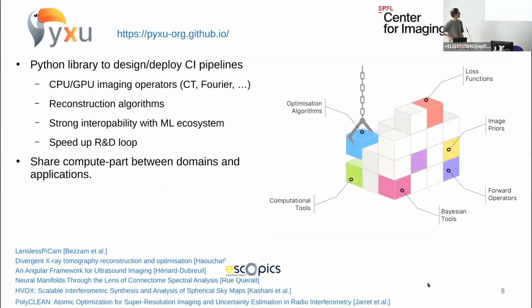So right now we are developing V3, which should be released in the next month or two. And I would say the main change compared to what you will see on the website is that we are having even deeper interaction with the deep learning tools that exist out there, so that you can easily plug them into whatever framework is out there for more advanced reconstruction.